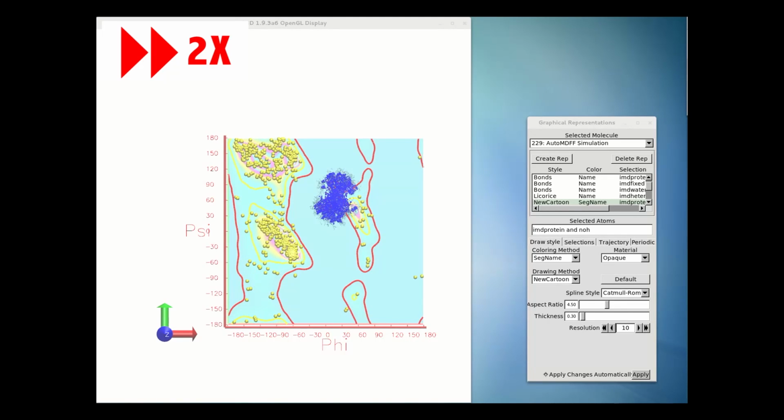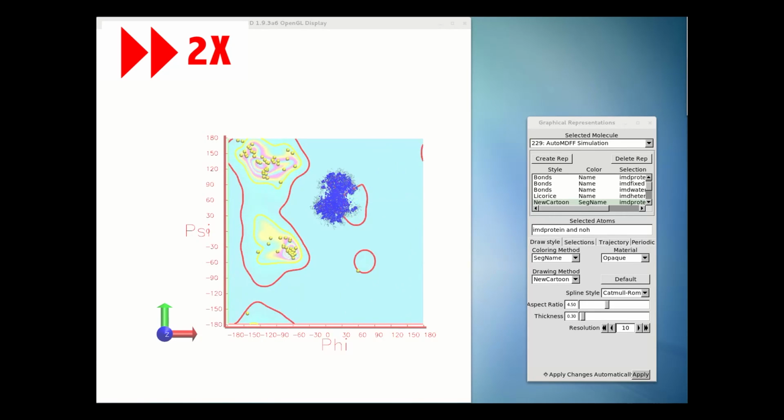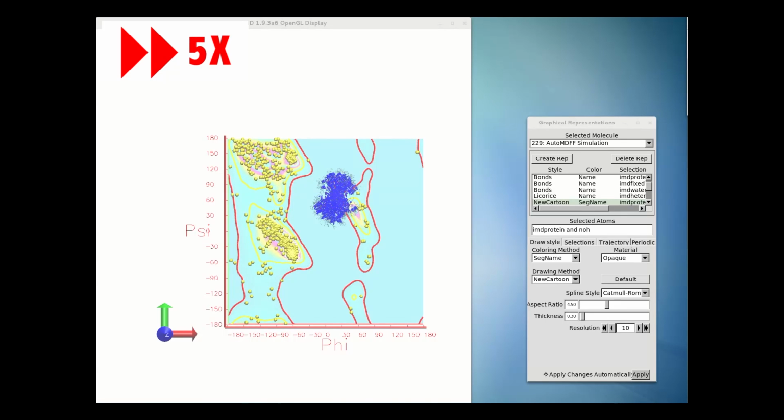While reliance on indicators like the Ramachandran plot can help you find and fix a great many errors, it's always a good idea to run a visual check over the whole structure to find and fix any errors that don't stand out obviously on charts. I find that mobilizing stretches of 50 to 100 residues at a time, along with directly contacting residues, is generally workable. It's fast enough so that I can manually fix most small-scale errors on the spot, while I can always stop and create a more localized simulation to handle more challenging problems.